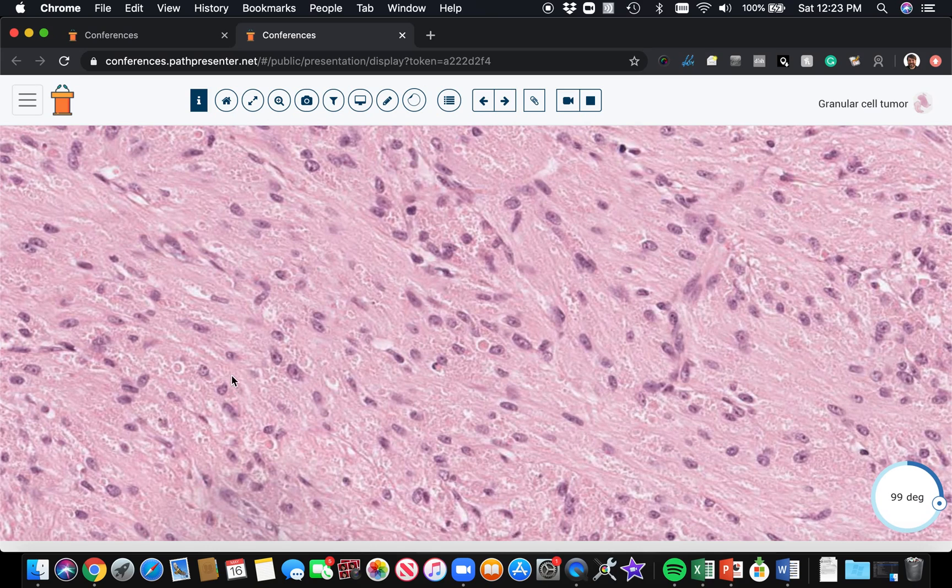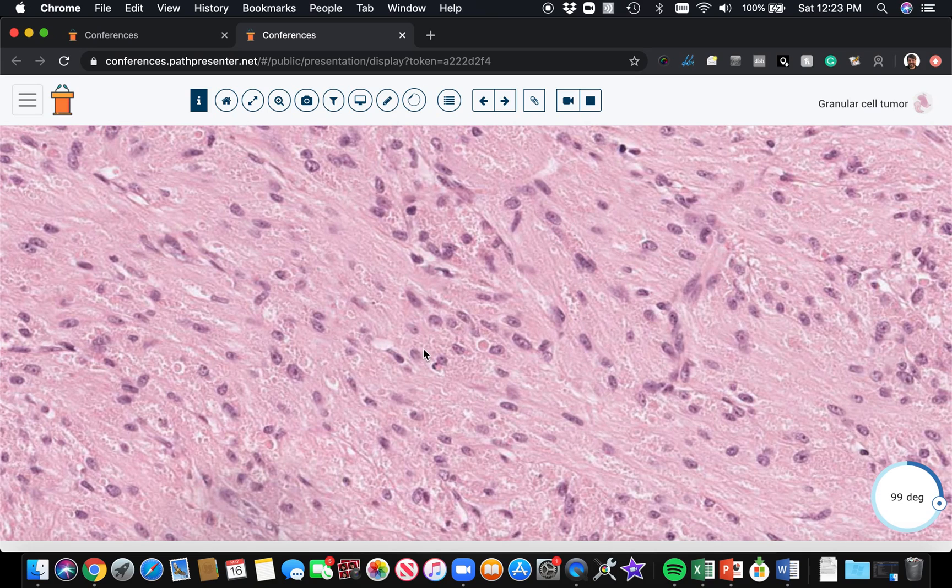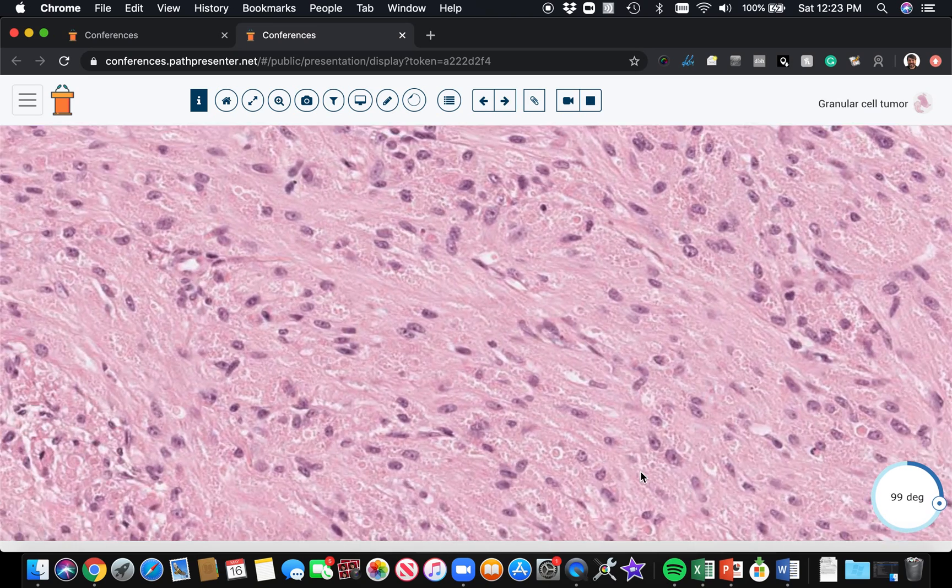Granular cell tumors have this granular cytoplasm. They tend to have cytoplasm merging with each other, so they have a syncytial appearance. It's like all these cells are sharing the same cytoplasm. You can't easily see where one cell ends and the next cell begins.